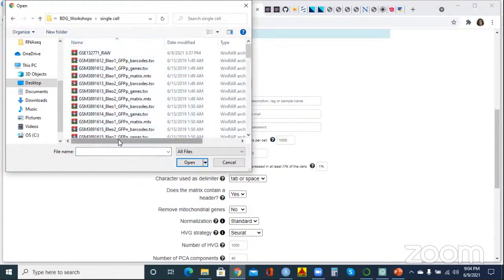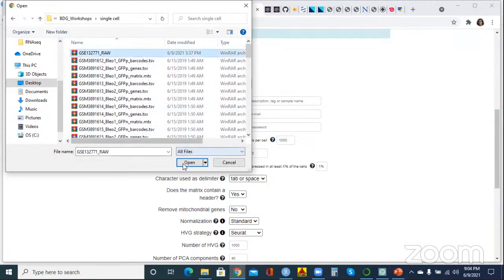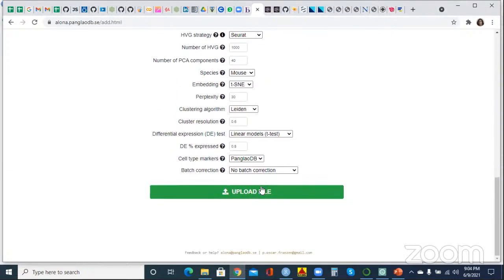You can see the zipped files, and no need to make anything, just upload. The only limitation is that this takes time, and you can see that it is uploading. So let it upload. We'll give it some time.